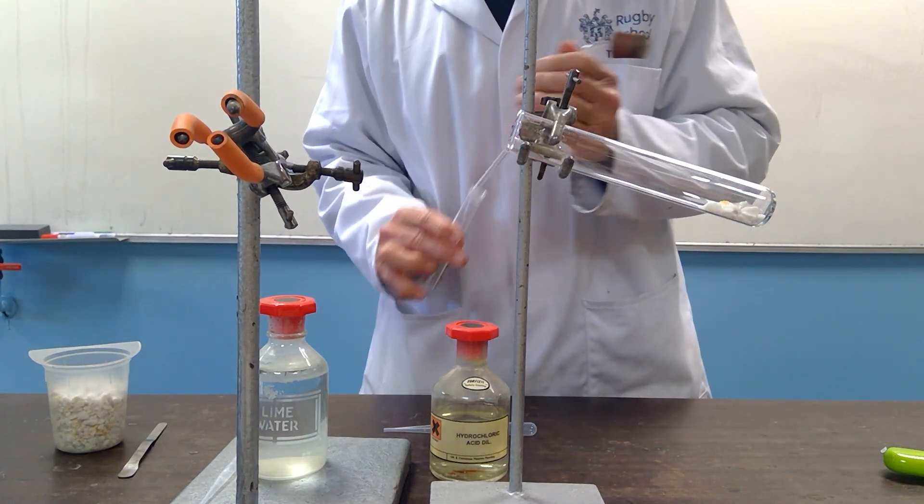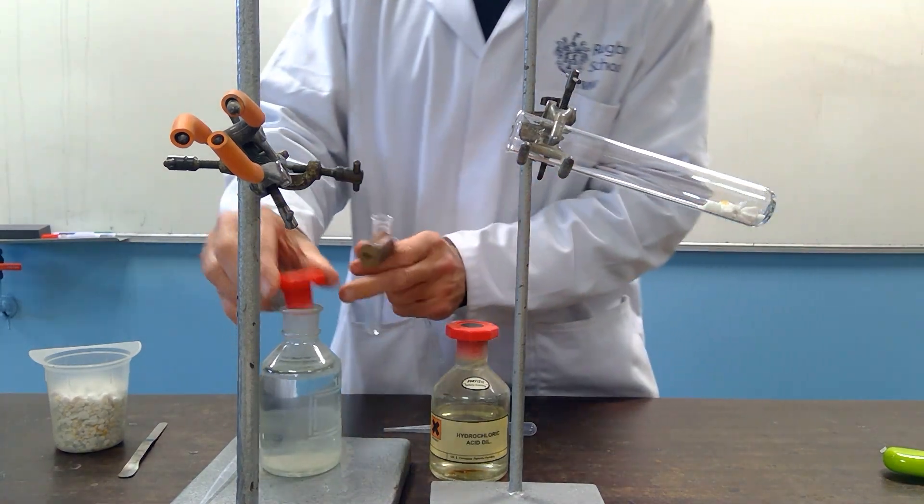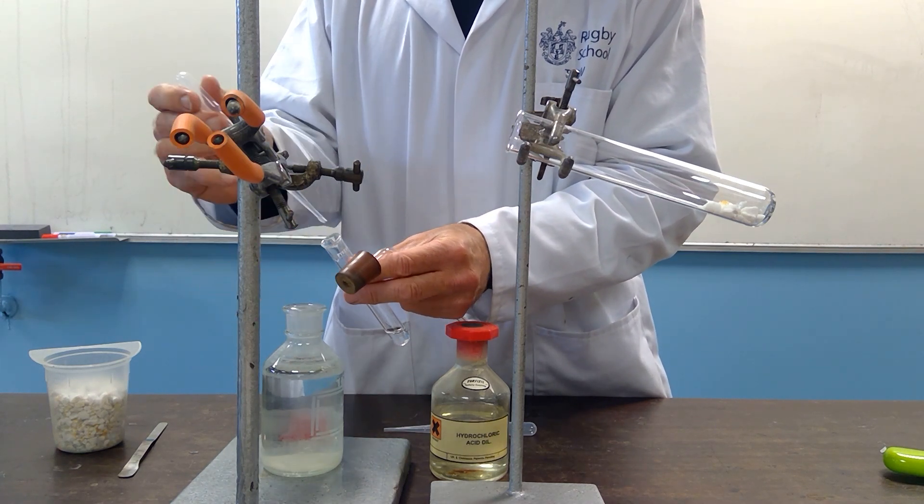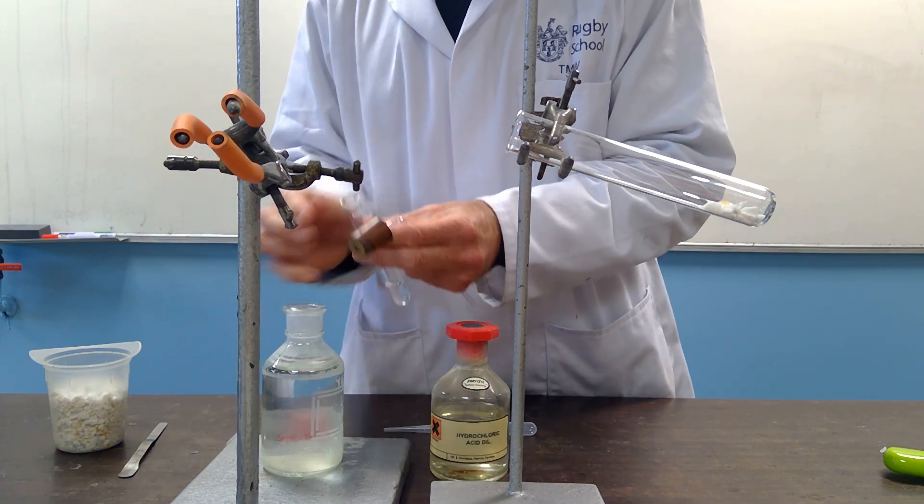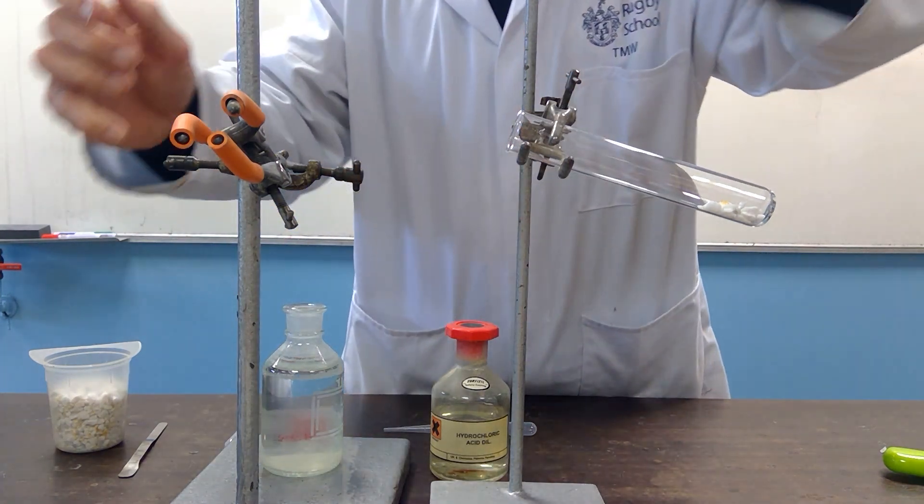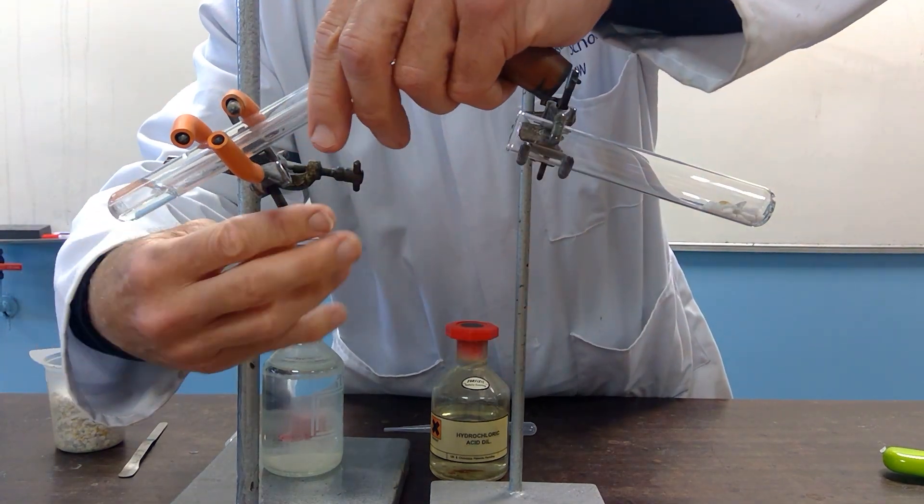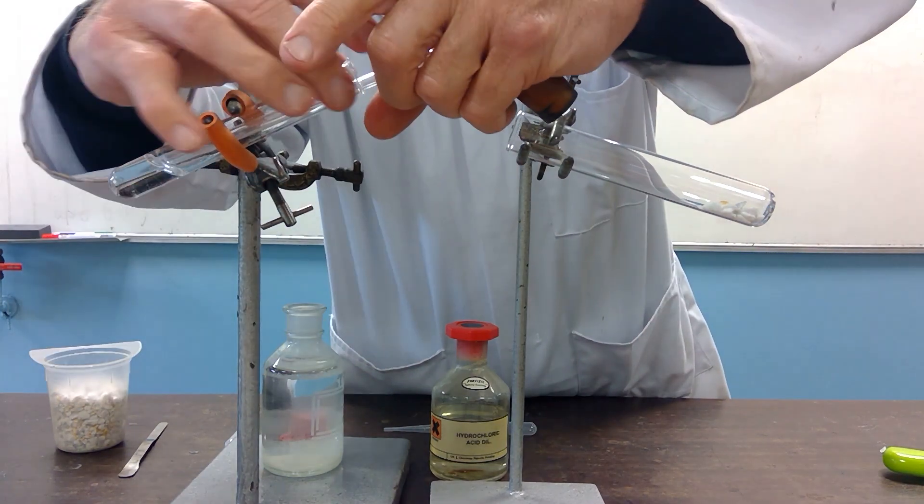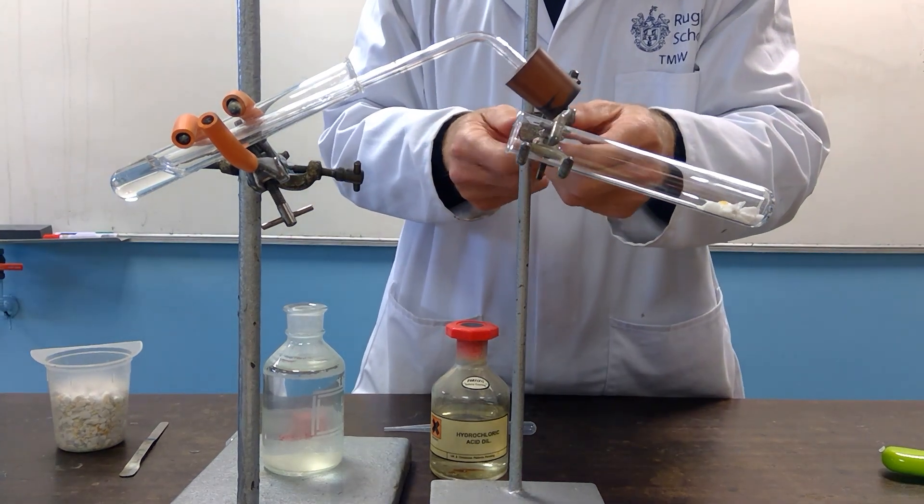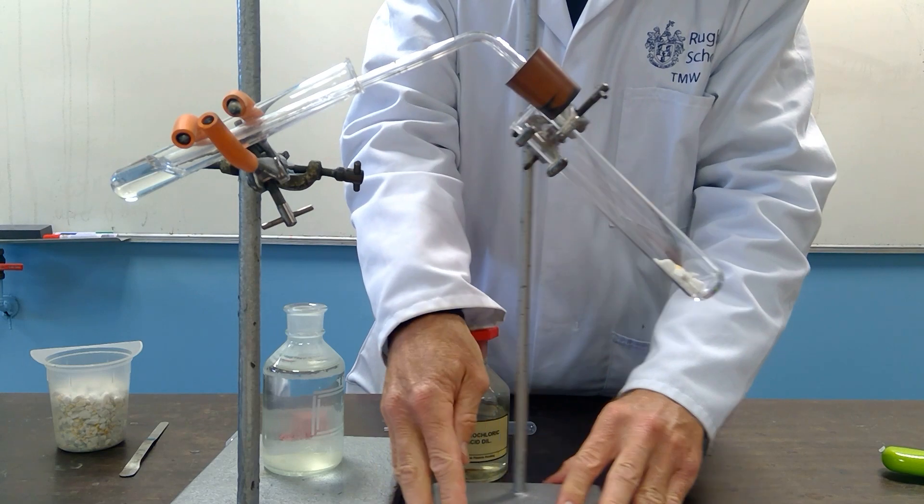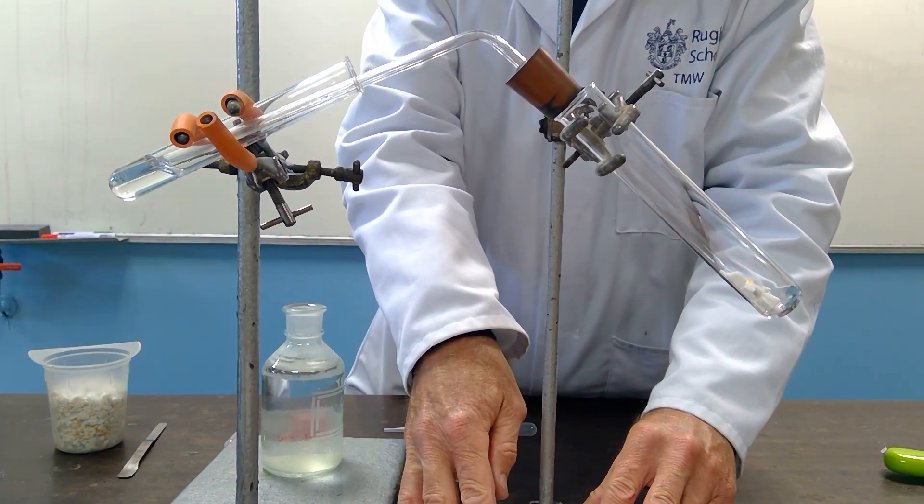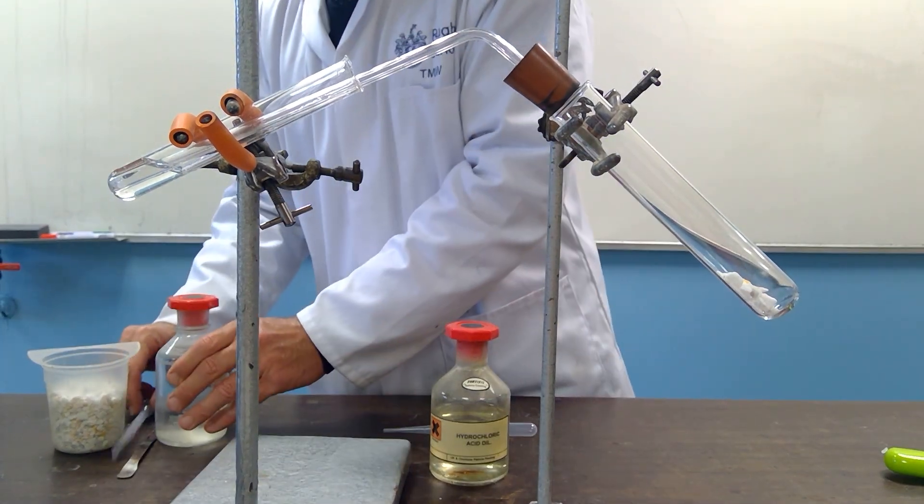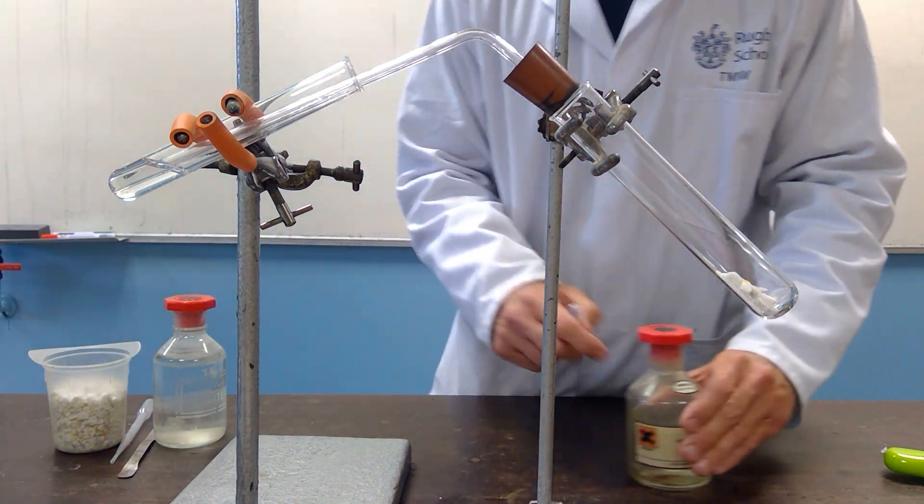So, if I once again set up with some of the lime water in the additional tube, this will be a way of proving and testing that we have carbon dioxide. And then we will be able to, as soon as the reaction starts and I add the acid, see if any of the carbon dioxide is given off.